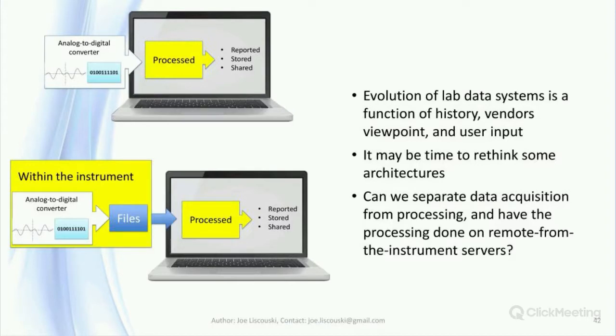One possible direction new development could take is the separation of data acquisition from processing. The instrument would have internal data capture capability for a set of samples, say an autosampler tray, for example, package the data into a file, and then send the file to a computer for processing. This could simplify overall lab information architectures and remove the silo issue.